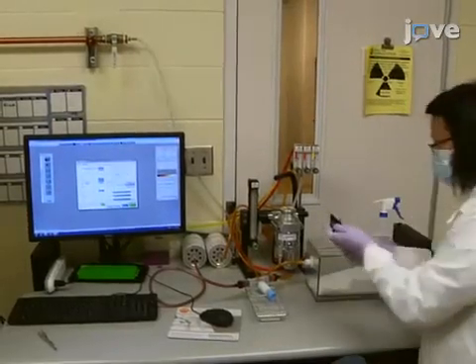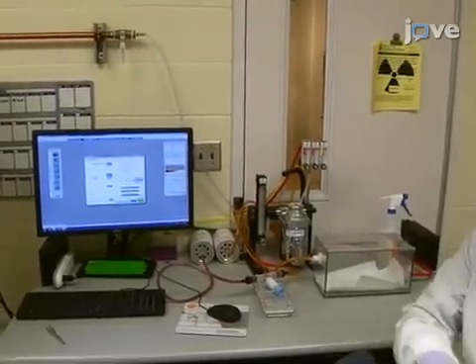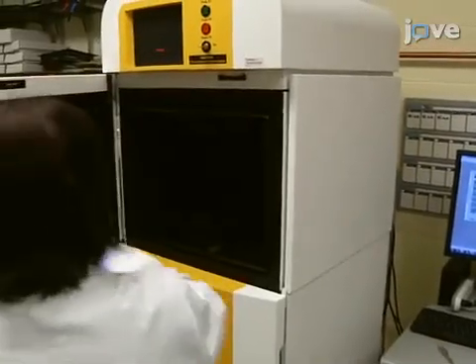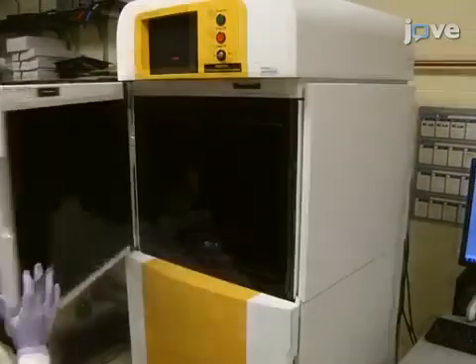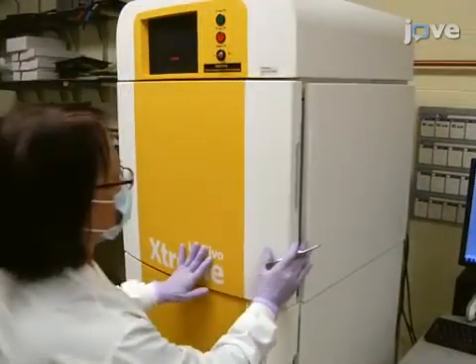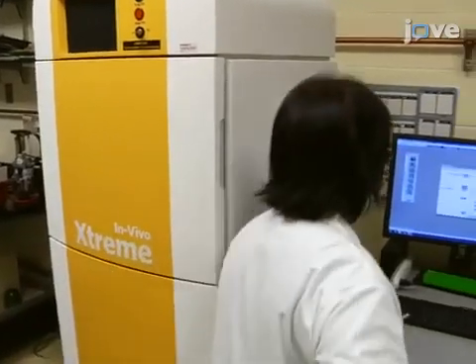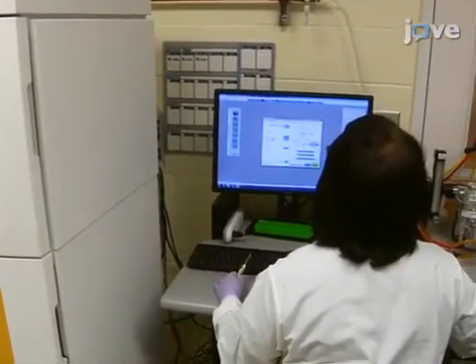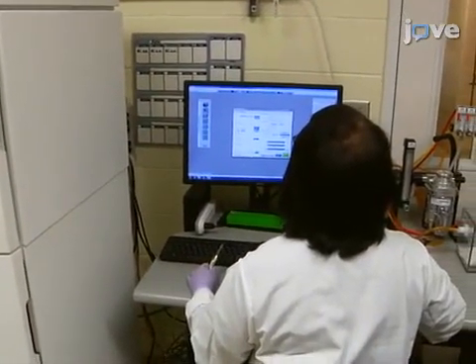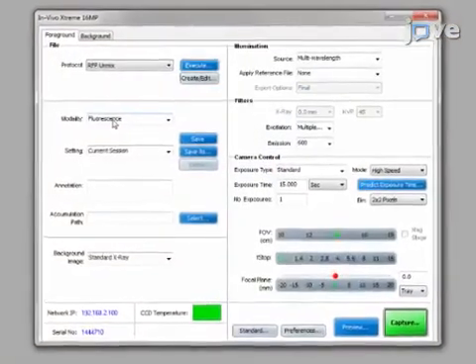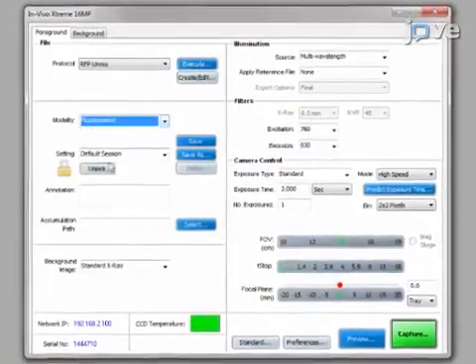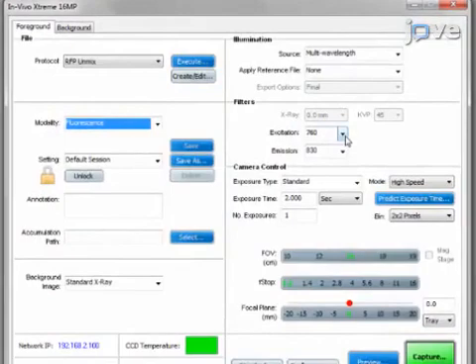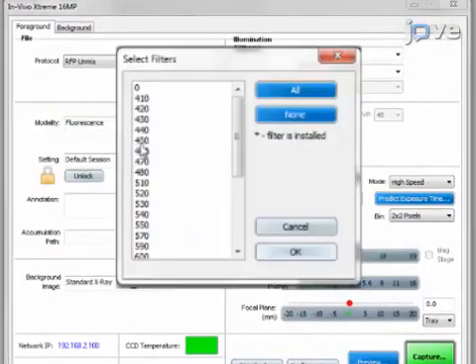After 10 weeks of tumor cell growth, place the body of each anesthetized mouse into a small animal optical imaging system, one at a time. Scan all mice in the cohort at each time point. To observe fluorescently labeled tumor cells, execute a multispectral acquisition to collect a total of 5 images.